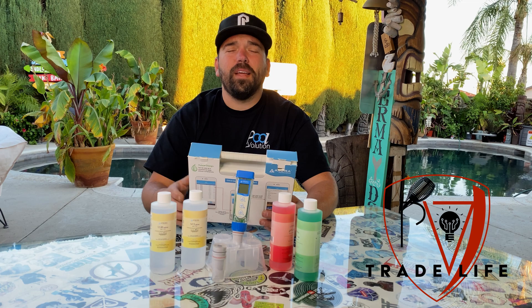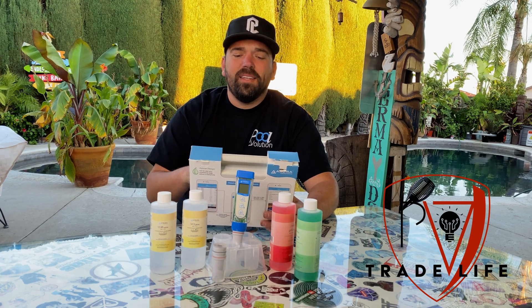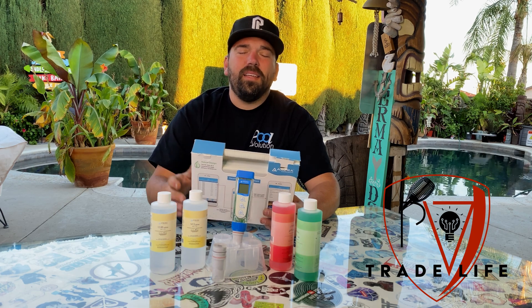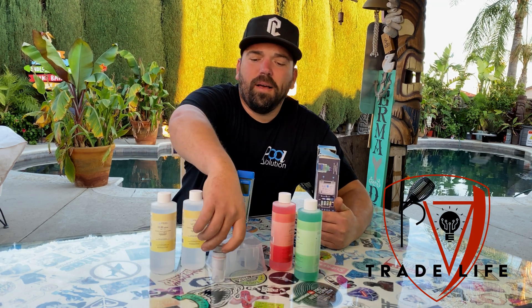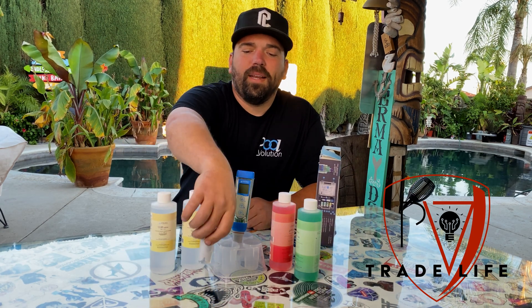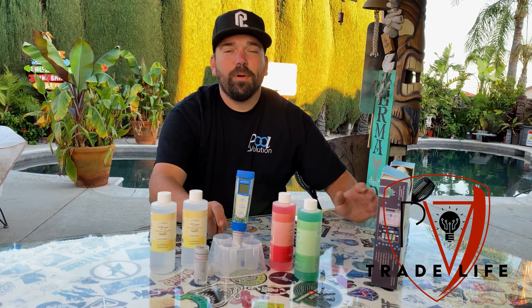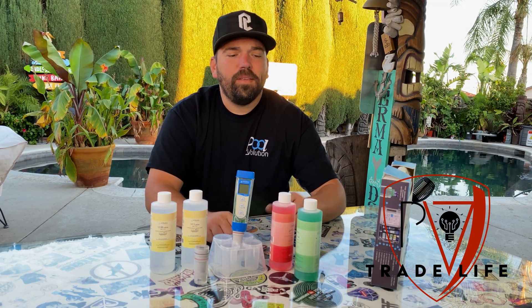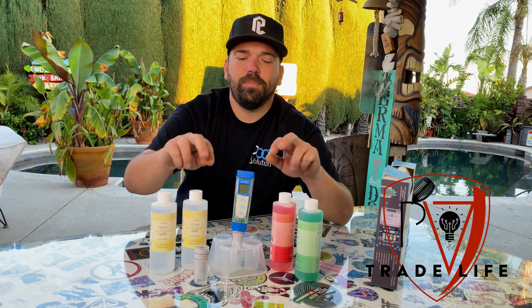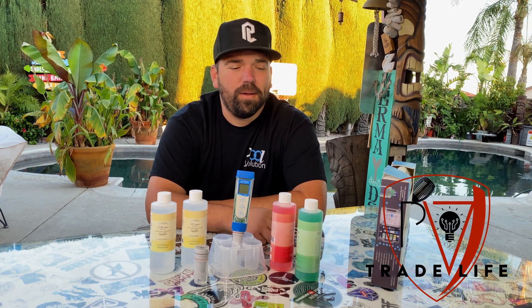You could go through your customer database and all that stuff. The PC60Z does pH, conductivity, TDS, temperature, and salinity. You can also get other probes — this is the ORP probe, which exchanges out and gives you an ORP reading, which makes it pretty cool. This is a calibration pod, sold separately, and you can also buy bigger solutions. We're going to put the solutions in these containers so I can walk through doing the calibration on this as well.